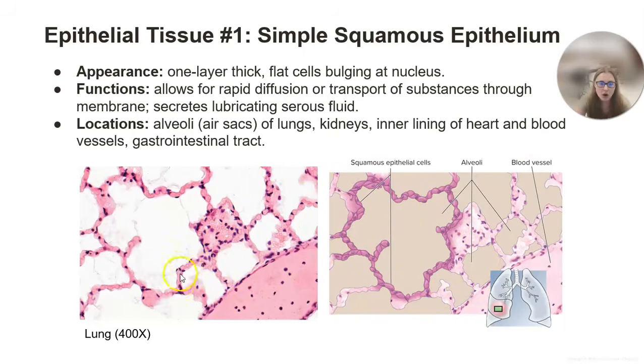What we can see here are all of these areas, these funky kind of borders. Those are all going to be our simple squamous epithelial tissue. You'll notice it's a continuous layer, a continuous sheet of tissue, one cell layer thick, and these cells can take any sort of shape in that tissue layer. They're all going to be pretty flat, pretty smushed, and just kind of smush in how they fit. These are each going to be our squamous epithelial cells.